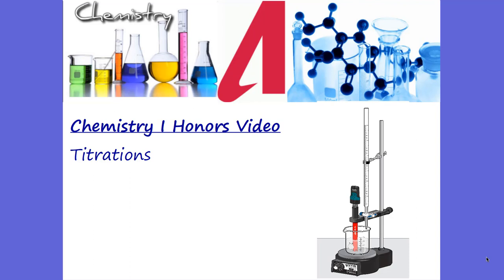Titrations are a really important part of acid-base chemistry. You've got to know how to do a titration, you've got to know how to interpret a titration, and you've got to be able to calculate a titration. So titrations are very important, so let's get to it.